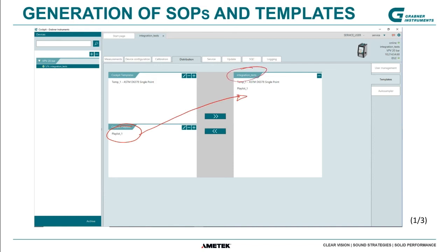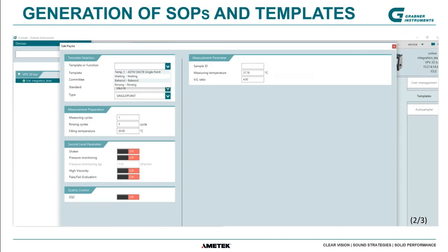This is the instrument section, and this template is really looking to use different types of standard operating procedures. For example, you can select which method to use for a certain position, and then it has 2 or 3 more special procedures: a waiting procedure, a cleaning or bake-out procedure, and a rinsing procedure.